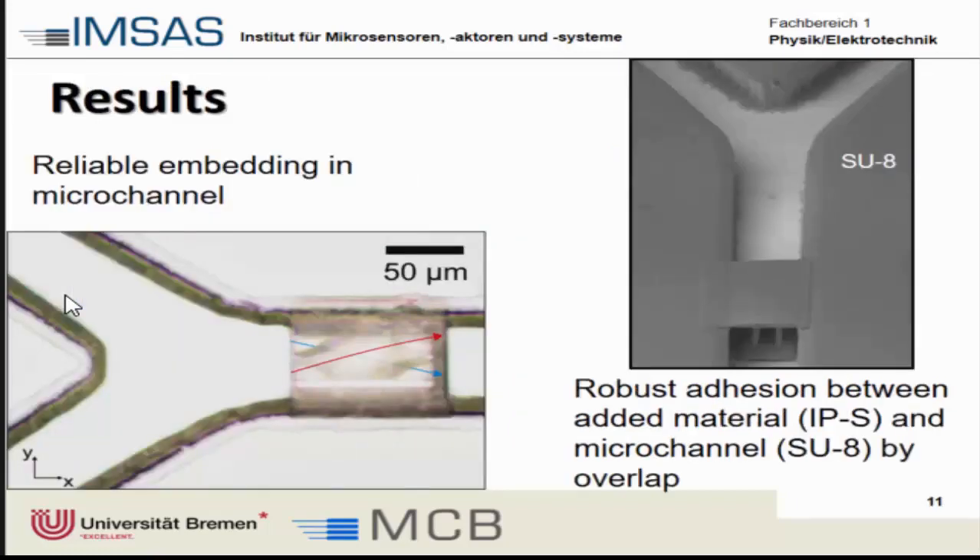These are some of the first trials. We can see that the element is well integrated within the channel and sticks really well to the edges of the SU-8. Looking at SEM pictures, we can see there is quite a robust fusion between both materials. Even if you try to displace it by blowing nitrogen on it or flushing with water, it holds quite well.